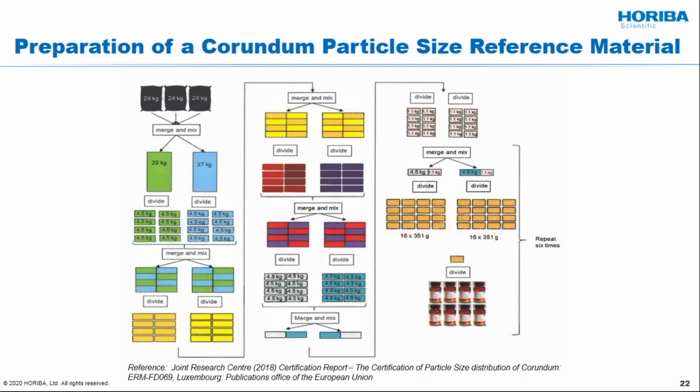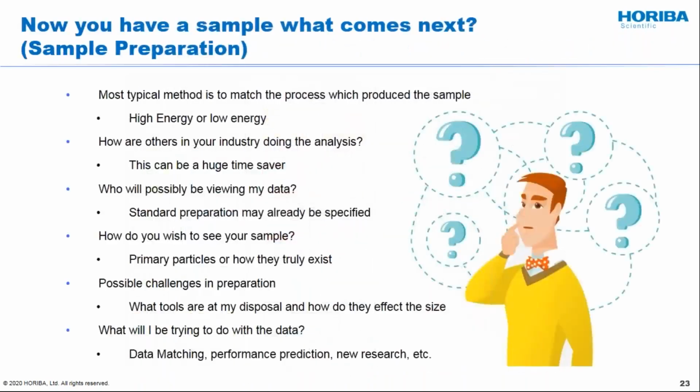And certainly the average customer is not doing this. You're talking about weeks and weeks of work, but it just shows you that if you want to get very, very repeatable types of samples, you have to go through a lot of mixing and analyzing and so forth to get good data. So again, just an illustrative example, but it shows you what steps you have to go through.